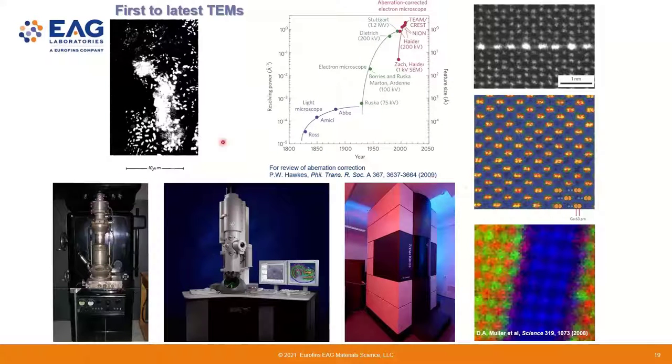Of course, this is a historical view of the resolution. I don't want to spend too much time here. Nowadays, Professor Muller, how many years ago? It's already 13 years ago, published this nice paper. It's about atomic resolution EELS analysis of these interfaces, right?